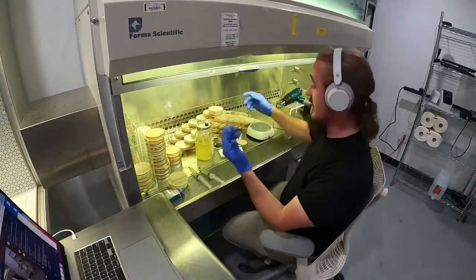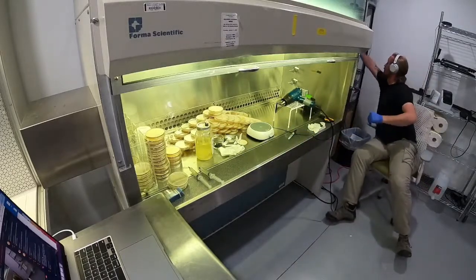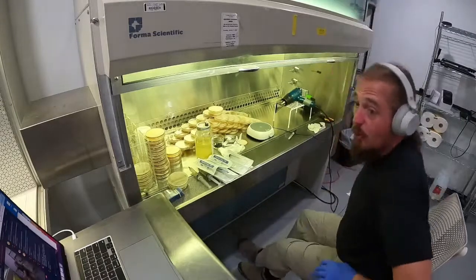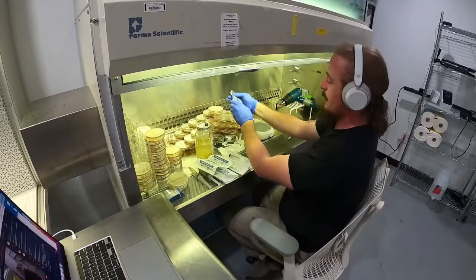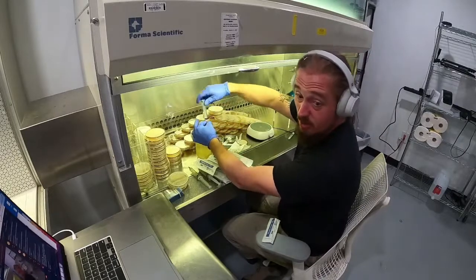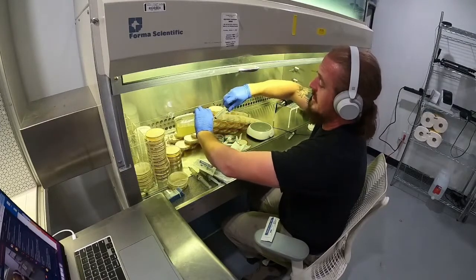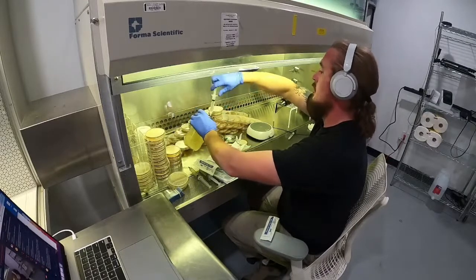But if you want to go and get cheap flow hoods, go to eBay, search for clean room fan filter unit, FFU. Those little bad boys have been running biology laboratories since, I don't know, 19th century? Yeah. Early 19th century, we pretty much figured that out. Actually, no, it was after the Spanish flu, which means it was after World War I. No, that was still 19th.